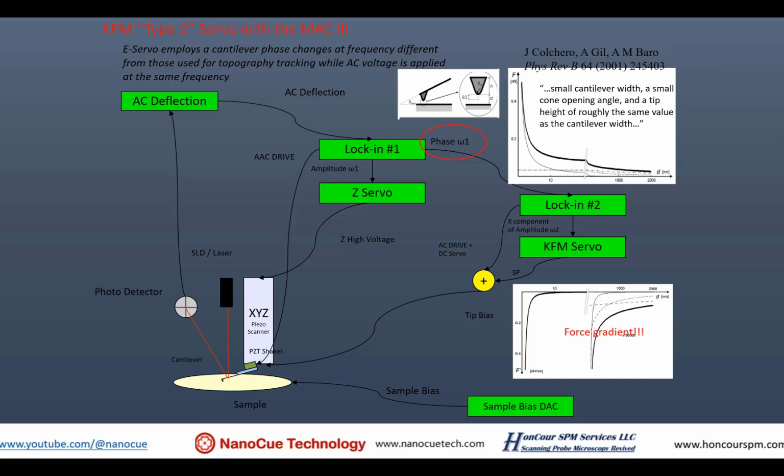Well, in terms of accuracy, the FM technique is superior, just because you always get some cross coupling of the electrostatic signal in the cabling to the input deflection signal. And if you're doing the FM technique, you're not measuring that signal.